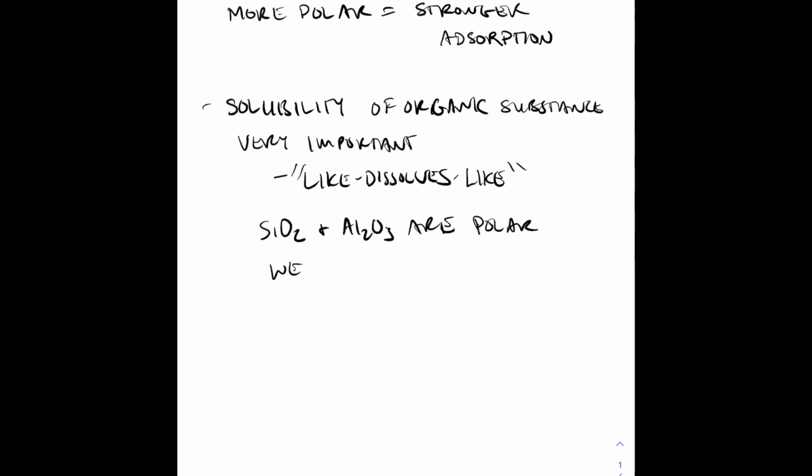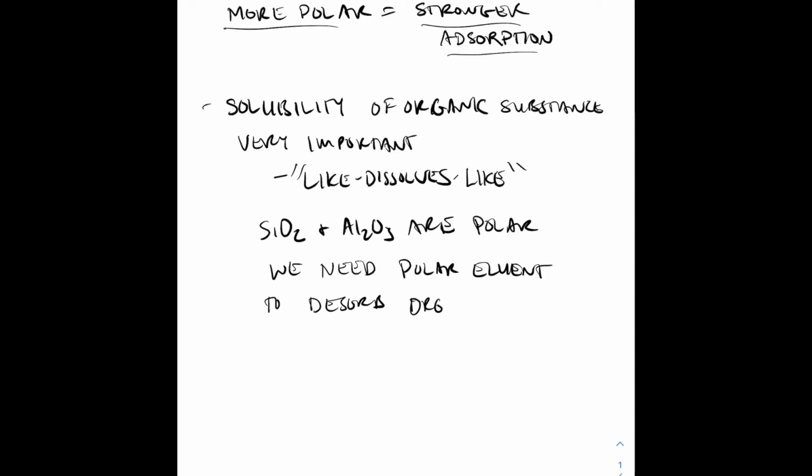That's why we say more polar equals a stronger adsorption, but that also means that we're going to require an even more polar solvent to desorb those organic substances. So we need basically a polar eluent, okay, to desorb the organic substance. I'll abbreviate that, okay?